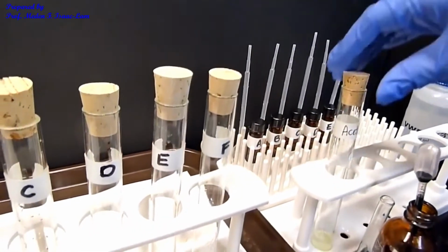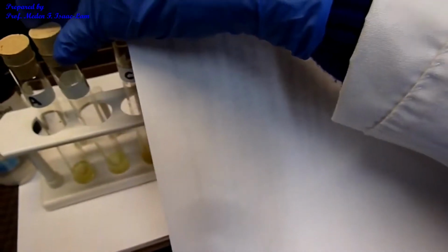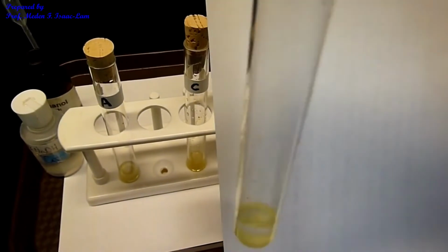So let's go back and compare with acetone again. So this is now the acetone, which is the standard, and you can see the yellow precipitate. And again, this is the acetone. Okay, acetone. And from our results, actually, it's the B sample, B unknown, also has precipitate at the bottom.